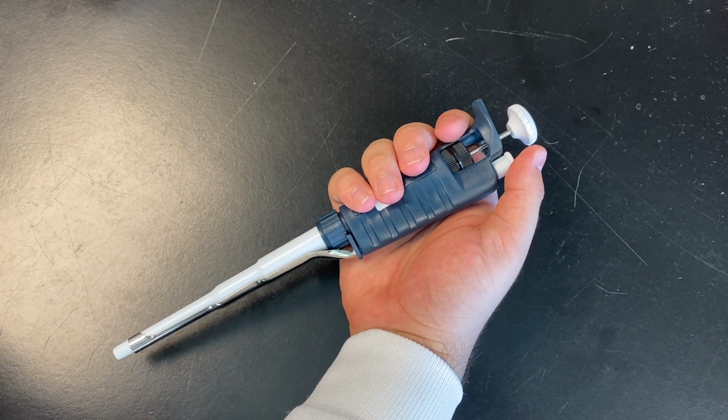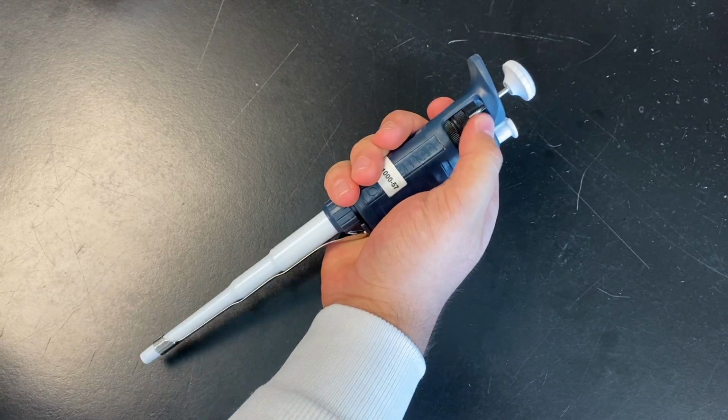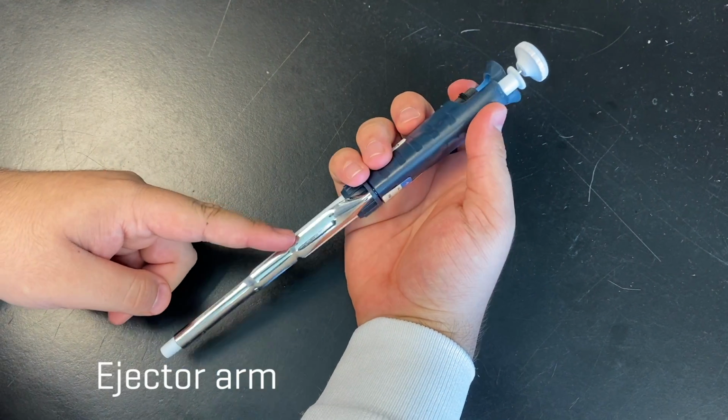The different parts of a micropipette are the plunger, the tip ejector, the volume adjustment knob, the volume window, the shaft, and the ejector arm.